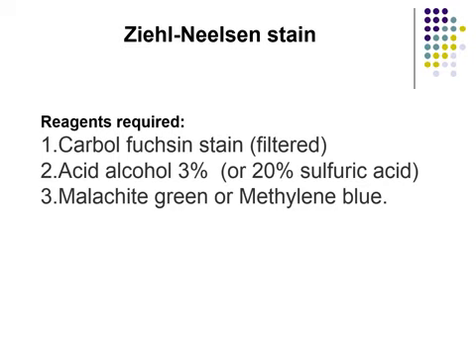This is a special stain for diagnosis of Mycobacterium tuberculosis. It consists of 3 reagents: strong carbol fuchsin, acid alcohol, and malachite green or methylene blue as a counter stain.